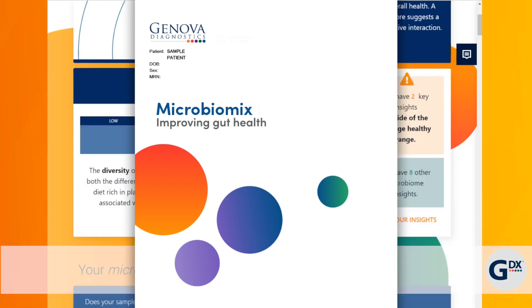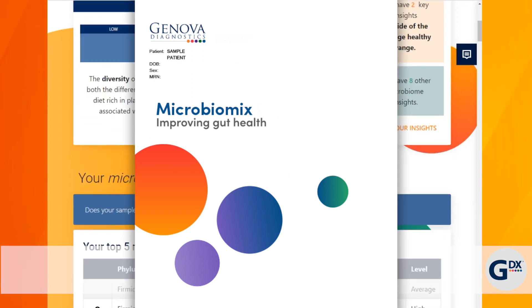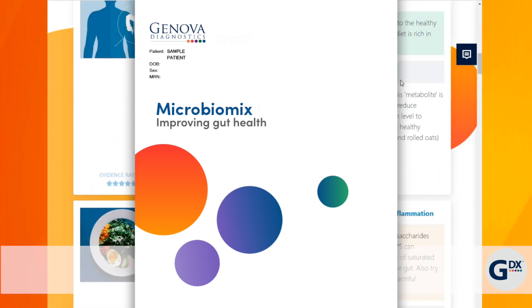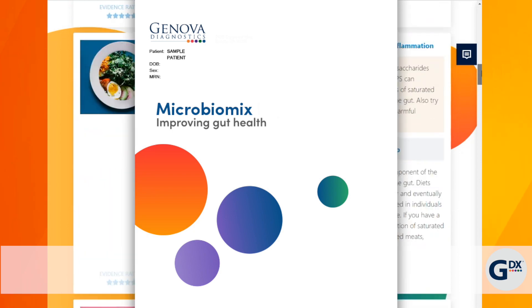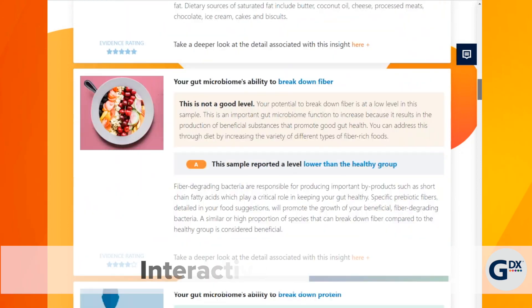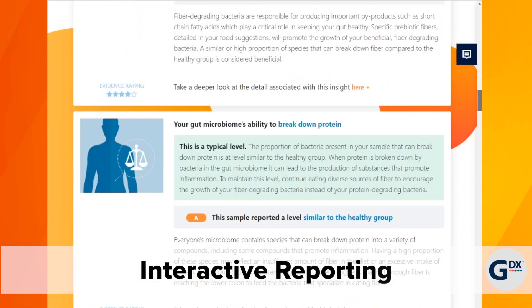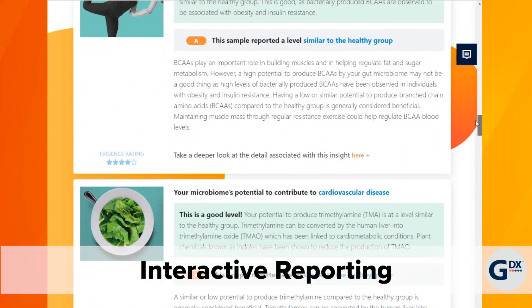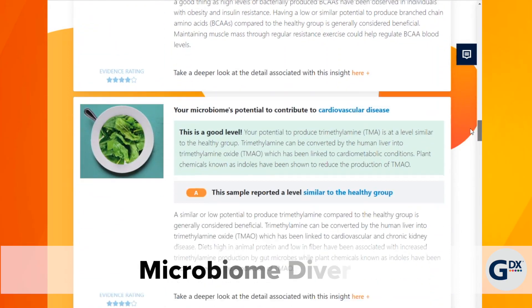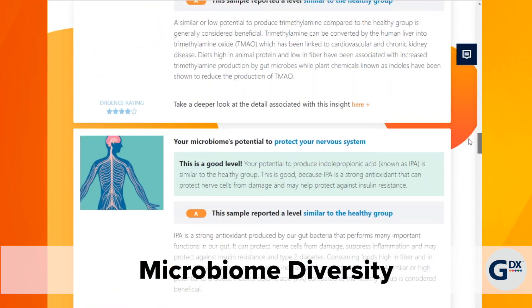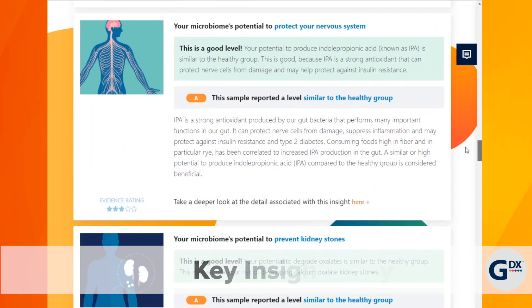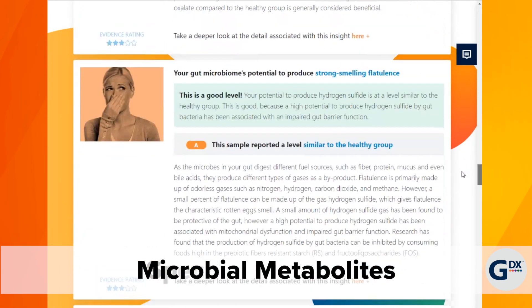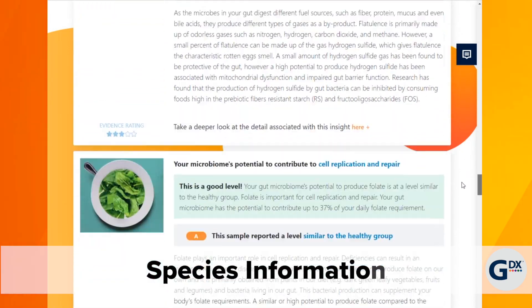Your results can be accessed within your MyGDX portal both in PDF form as well as a dynamic interactive report. Interactive reporting allows easy access to a significant amount of information right at your fingertips: microbiome diversity, key insights, microbial metabolites, species information, and more.